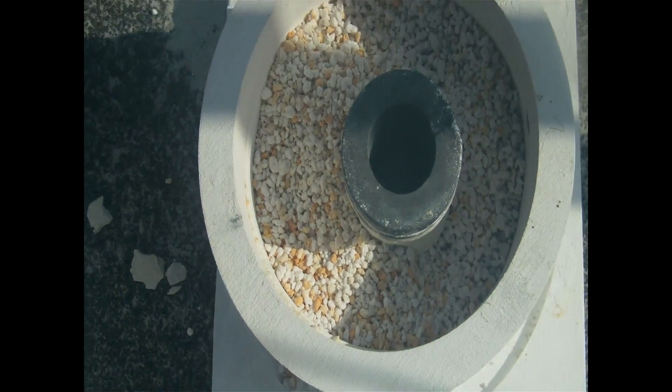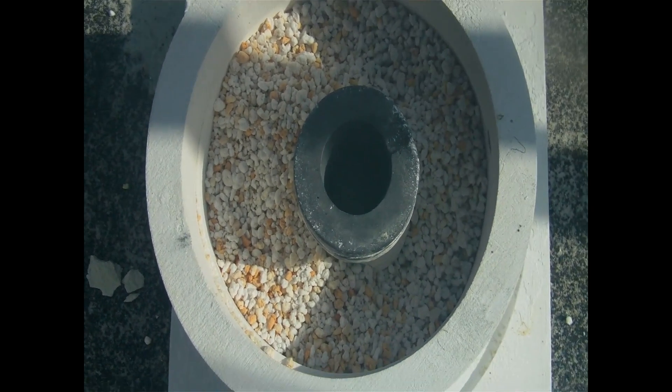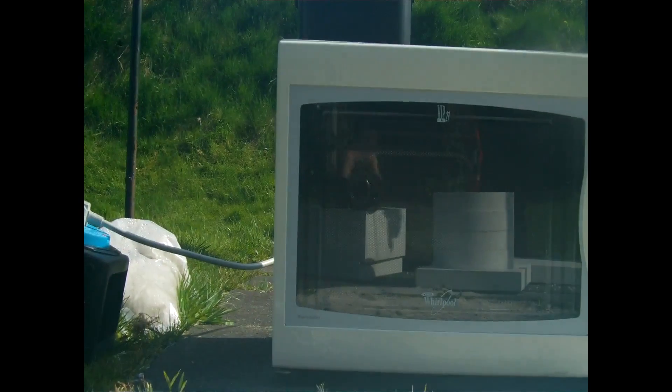Welcome to experiment six. Here we have a graphite crucible with a tungsten wire wrapped around it, embedded in bonachite, surrounded by perlite, in a calcium silicate insulator box. We'll pop that in the microwave and see what happens.